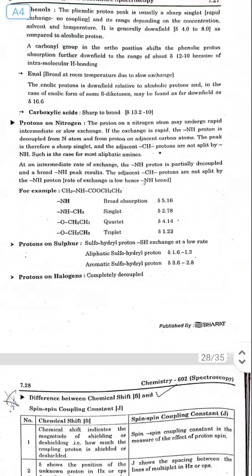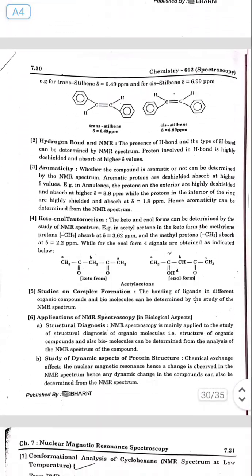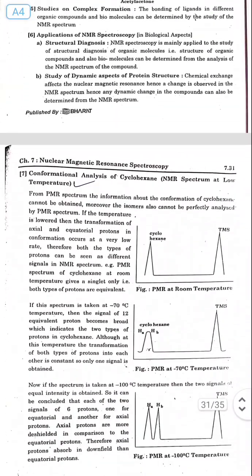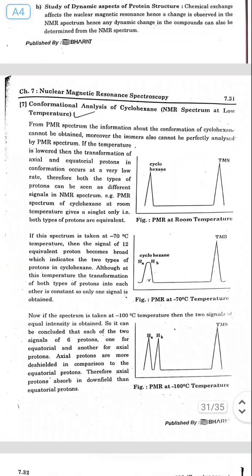And remember also, this is conformational analysis by NMR. Here we can also discuss H1 NMR spectrum interpretation, a stepwise approach when solving an exam problem.